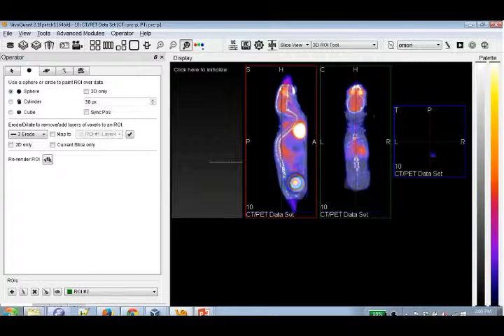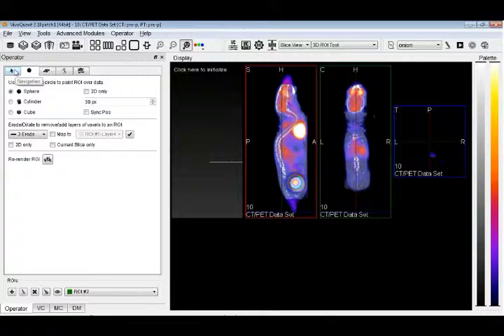If there are any questions, please bring them up. This has kind of been my recurring question. If I like your Onion tool, could you send it to me and I could quickly install it into my version of VivoScript? So you don't even need to install it because it's a script. It's just a .dqs file, just like a MATLAB file is a .m file. So I would email that to you, and then you would either run it through here, or run it through the other way that Gabe will show you. But then you don't need to install it.